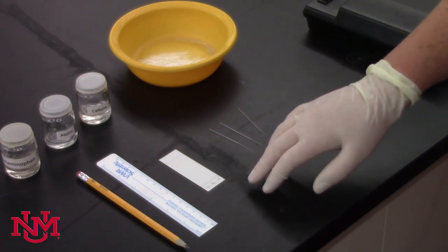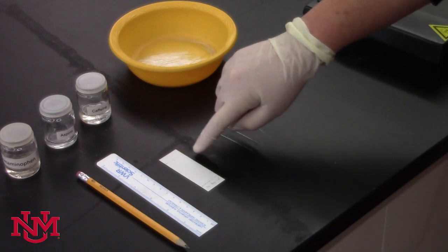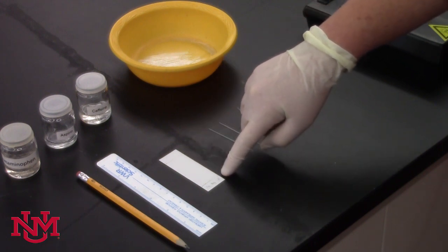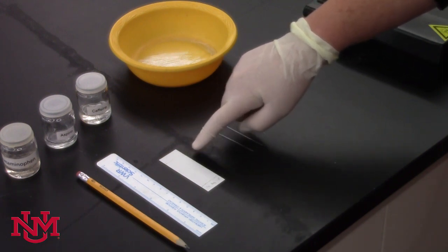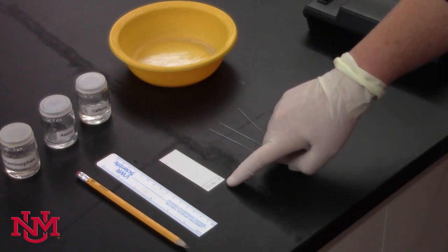You never want to use ink, you always want to use pencil. You'll mark your TLC plate with two lines, about a centimeter from the bottom and a centimeter from the top.